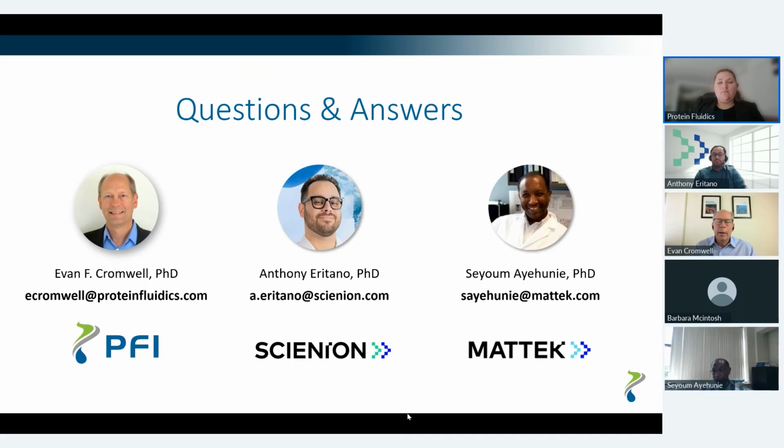I would add to that. A lot of high content image analysis has been developed around 2D cell images, where you can identify each cell, segment that cell, and look for the membrane, the nucleus, and the cytoplasm. It's amazing what you can do when you can identify your cell and then do analysis on that. Once you go to 3D, overlapping cells and everything kind of gets mushed together.